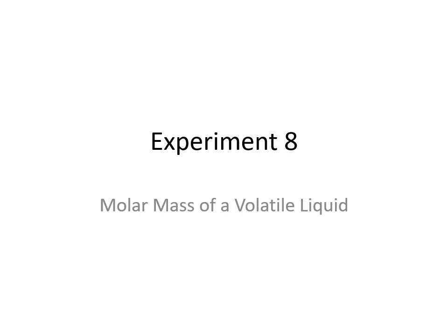The goal of experiment 8 is to find the molar mass of a volatile liquid. So we have an unknown liquid that we are going to determine its molar mass by turning it into a gas.